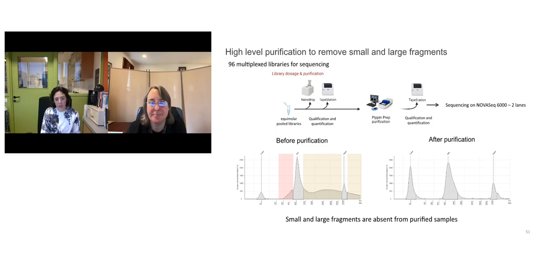So we experienced this issue of index hopping, and we tried to solve it by using high-level purification to remove those fragments that could contribute, in the library preparation, to this index hopping.